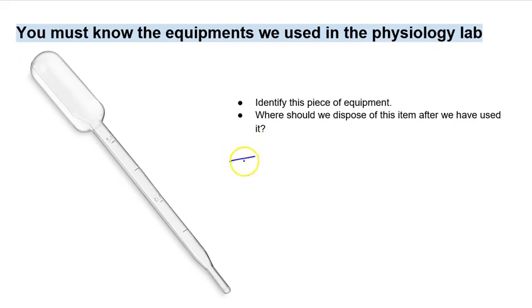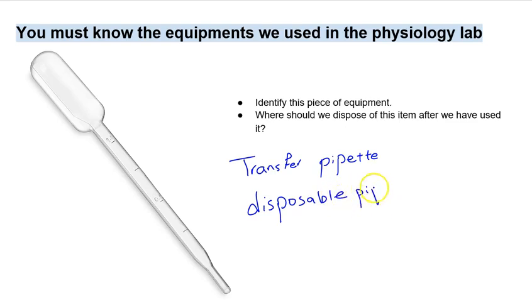So we have transfer pipette in this picture, which is also known as disposable pipette. If you remember, we disposed of this item after we used it in the regular trash.